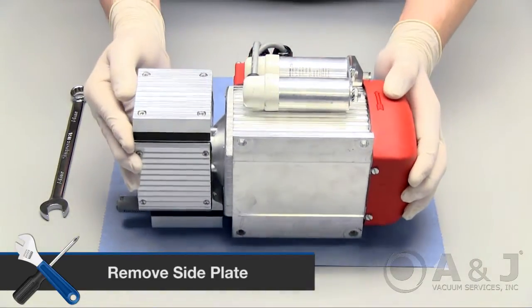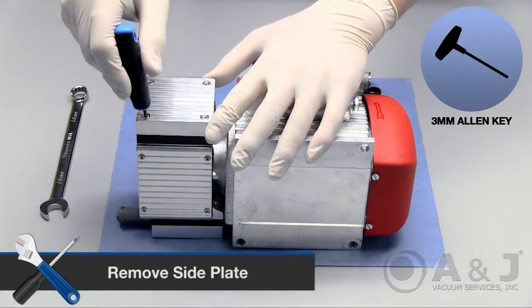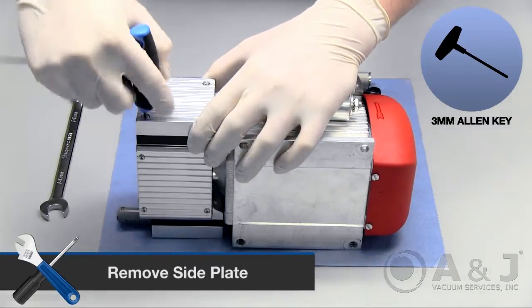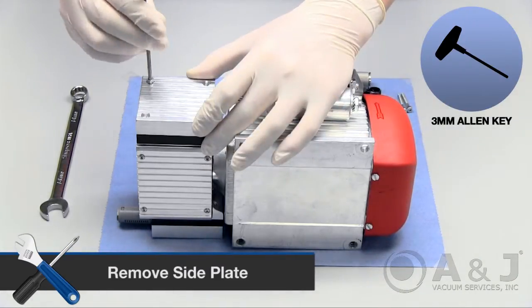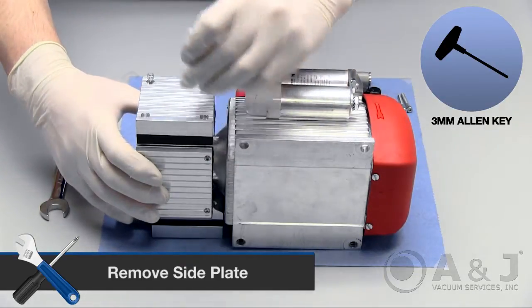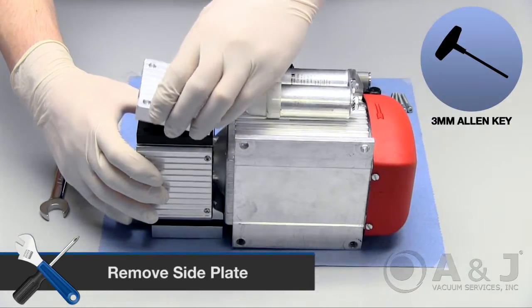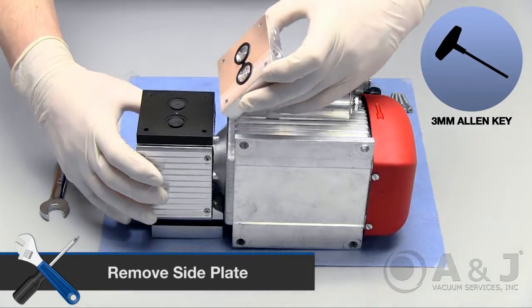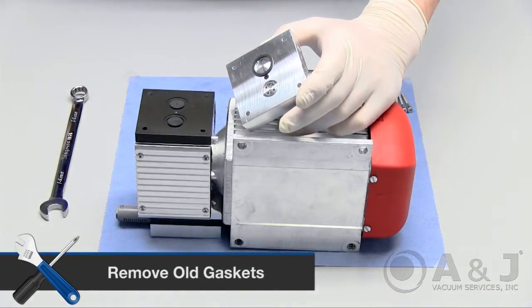Turn the pump over on its side. Remove the side plate by removing all four screws with a 3mm Allen key. Carefully remove the old gaskets from underneath the side plate.